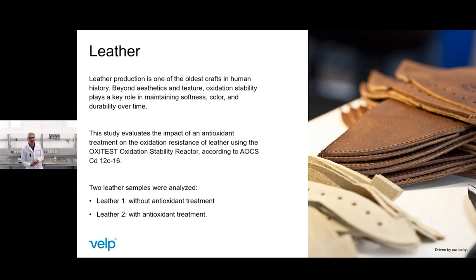During this study, the effects of the antioxidant used during the tanning process have been evaluated. Moreover, the induction period for a non-treated sample has been evaluated in parallel. The test has been performed using the oxy-test reactor according to the AOCS method.